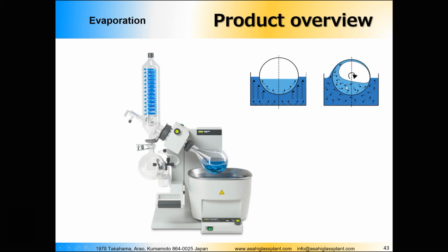But when we start to rotate the flask, the solution inside will wash around the surface of the flask. So the total evaporation surface will be like this. It is 2 to 3 times higher than the stationary flask, and obviously the evaporation speed will be 2 to 3 times higher.